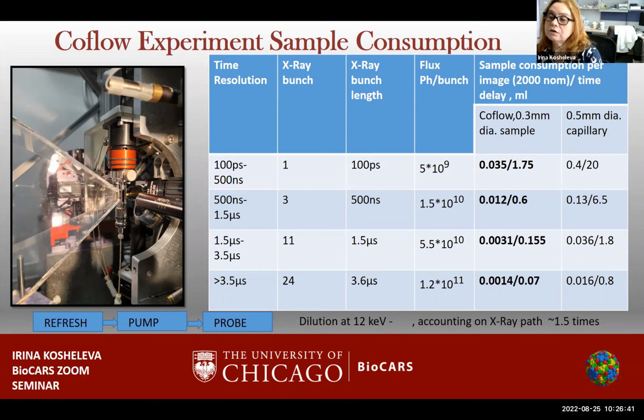still, of course, a big value, but much more achievable than the standard flow cell value if the reaction is irreversible. And the pH jump, or for example, cage compound ligand binding, enzymatic reaction of some sort, all these reactions which are very interesting to study, they were often irreversible, and we have big problems studying those with a single X-ray bunch.